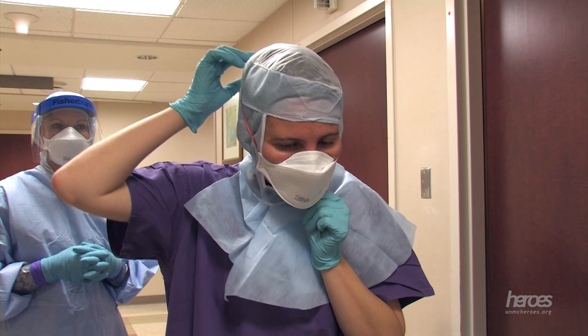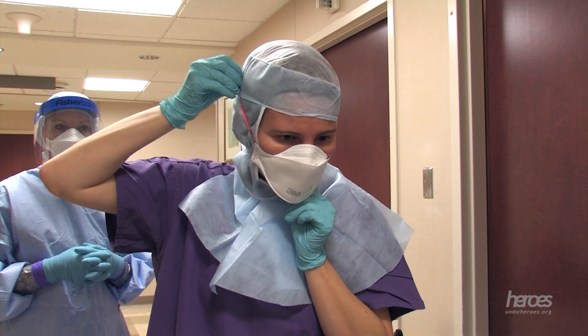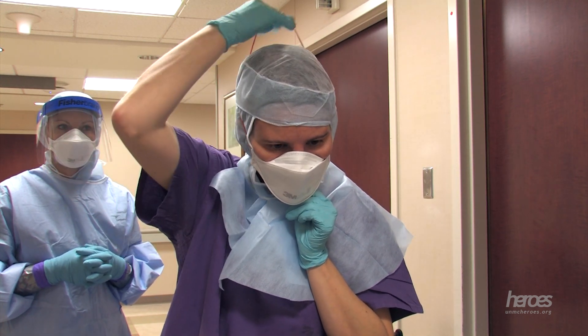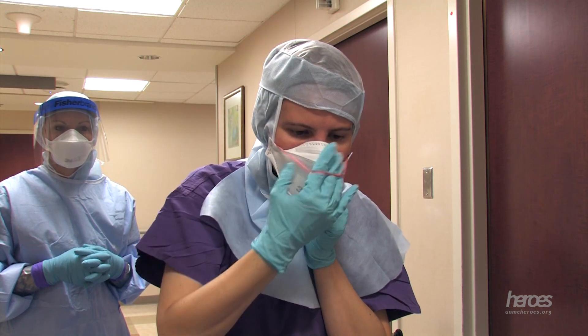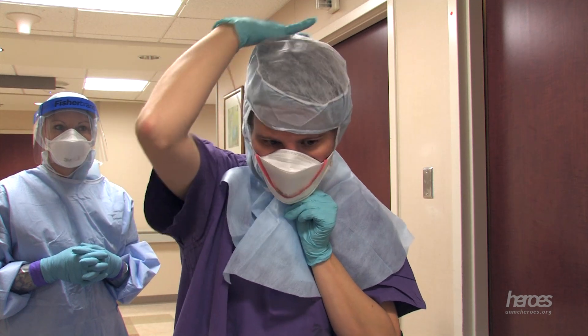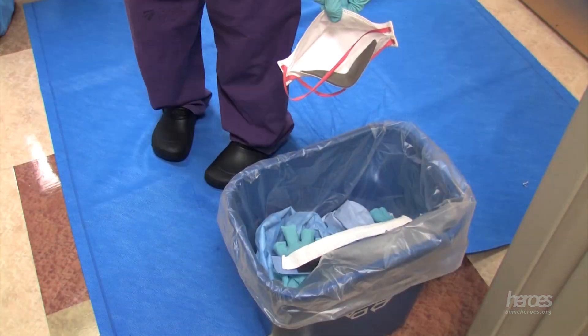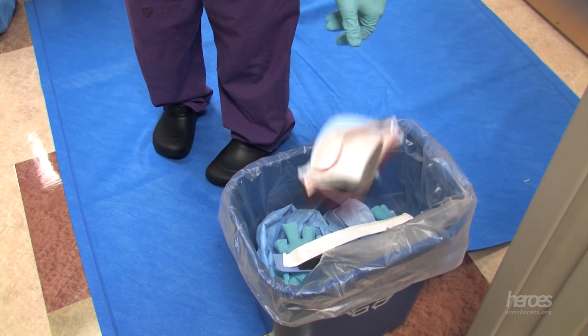The N95 respirator is the next piece of equipment to be doffed. Remove the N95 respirator by holding the lower corner of it firmly but exposing as little of your gloved hand as possible to its soiled surface. Remove the straps from the crown of your head and the base of your neck by slowly taking them over your head. Gently place the N95 respirator in the trash.